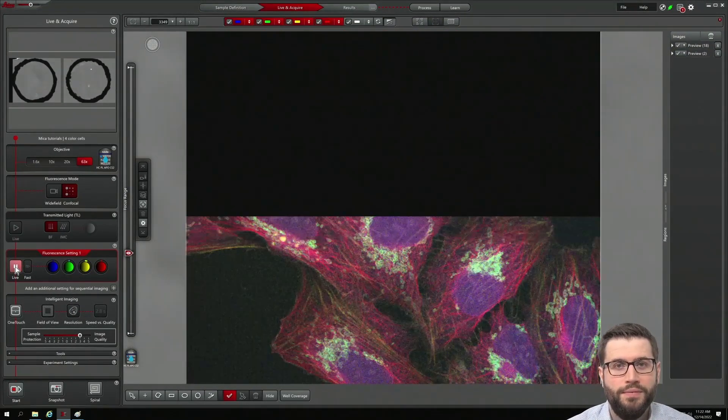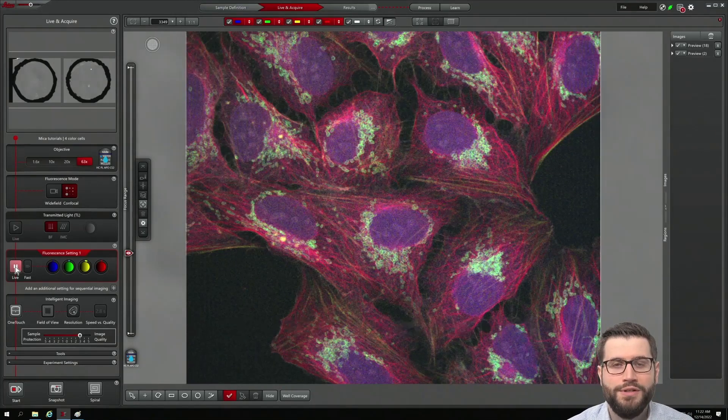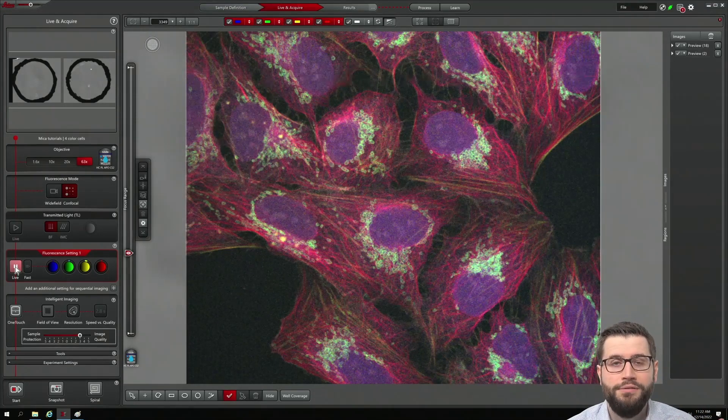The really cool thing is that the adjustment of the imaging parameters stays the same in Wide Field and Confocal mode.